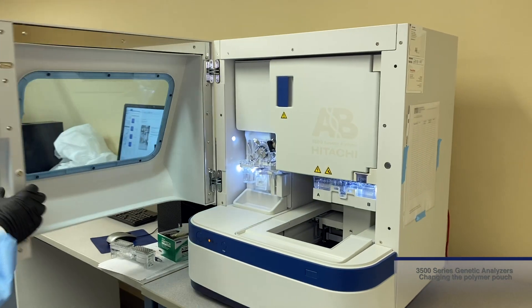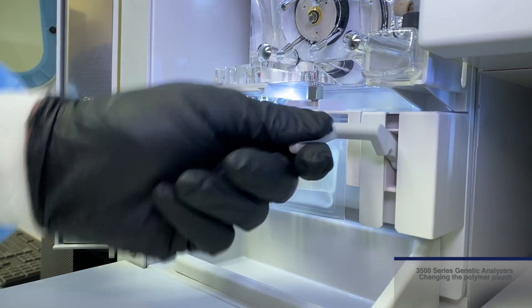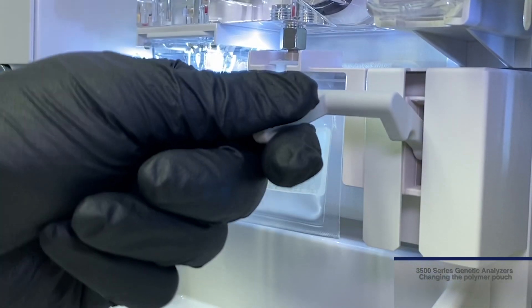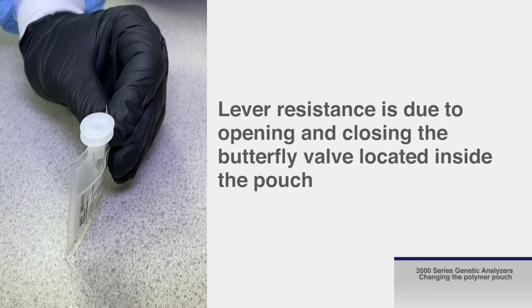With the main door open, pull down the lever next to the currently installed polymer pouch for removal. You will feel some resistance when pulling the lever up and down. The resistance is due to opening and closing the butterfly valve located inside the pouch.